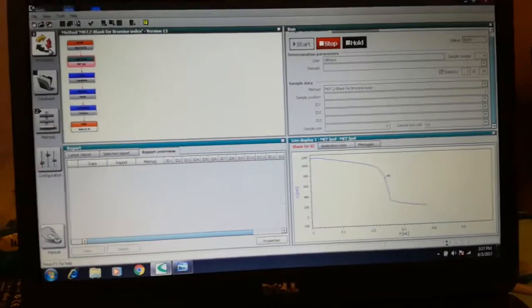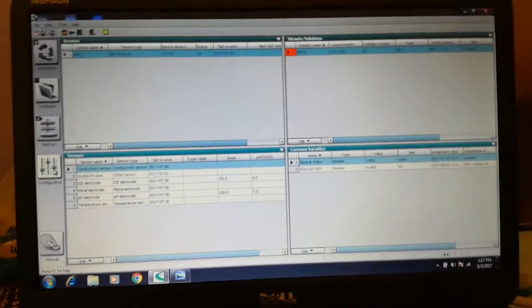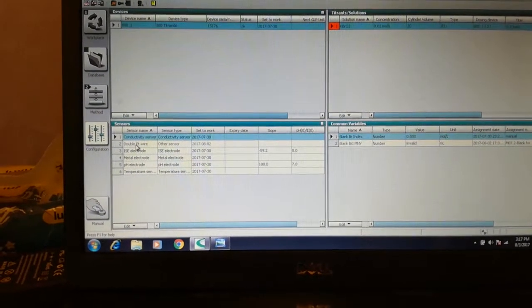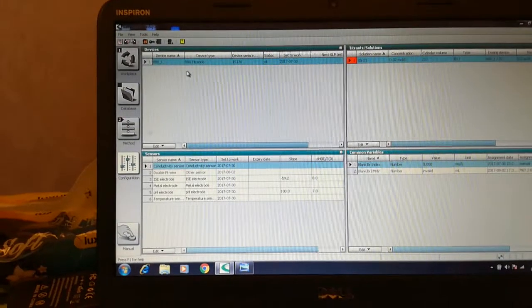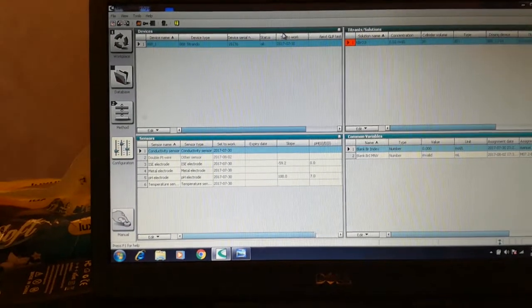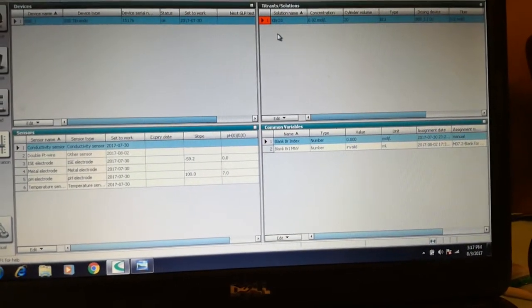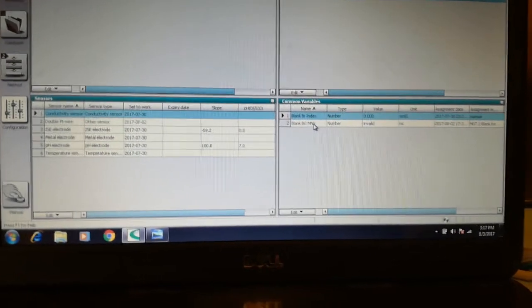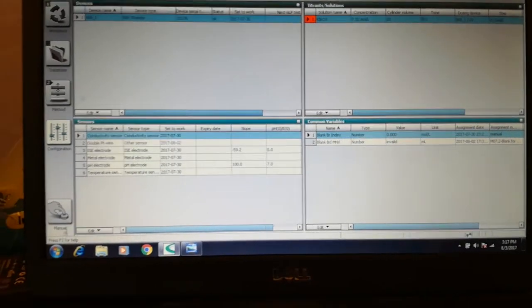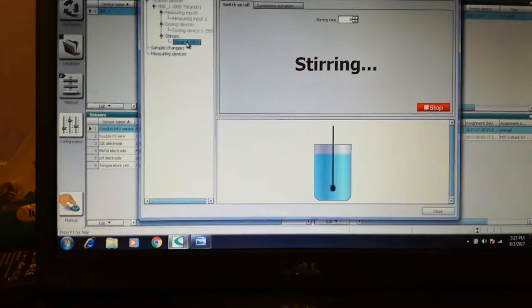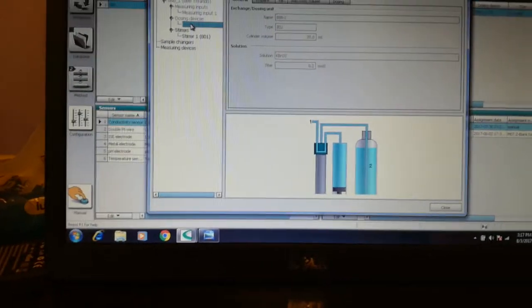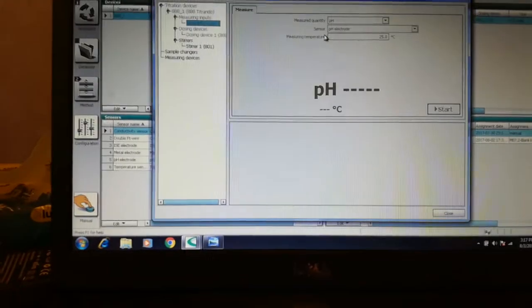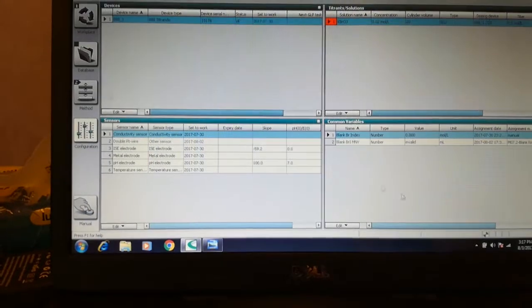Let's see the configuration. These are the electrodes we are using — this double platinum wire electrode or sensor. This is the name of the instrument we are using, the auto-titrant, and this is the solution name and titrant. This is the blank value variable. From here you can control the stirrer, the dosing system, the burette, and the measuring input.